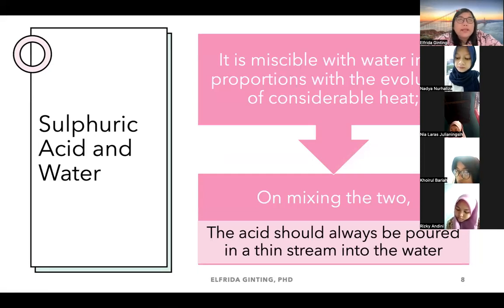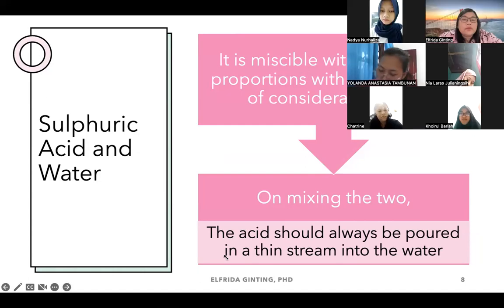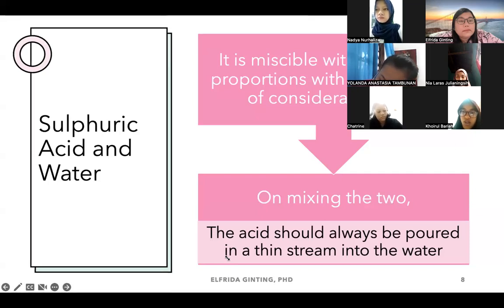this is sort of like a basic lab knowledge for you guys. Yeah, so when you need to mix water with sulfuric acid, how do you mix it? Do you put water into the sulfuric acid or the sulfuric acid into water? How do you mix it? Sulfuric acid into water. Into water, ma'am. Sulfuric acid into water. So never ever put water into sulfuric acid.